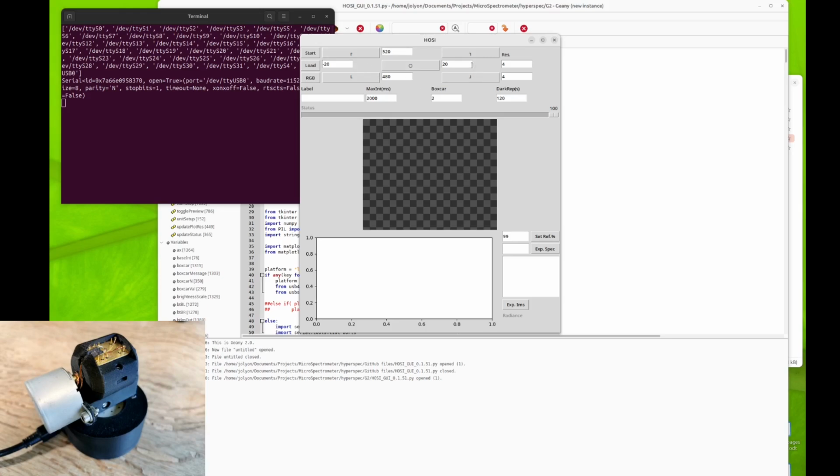When we're taking a hyperspectral image, the stepper motors control the pan and tilt axes, and so we can specify the leftmost point, so the pan axis left point, which is here we've got -20, and then going to the rightmost point +20. And the resolution of the tilt axis here is currently 4 steps. And the units of all of this is in steps.